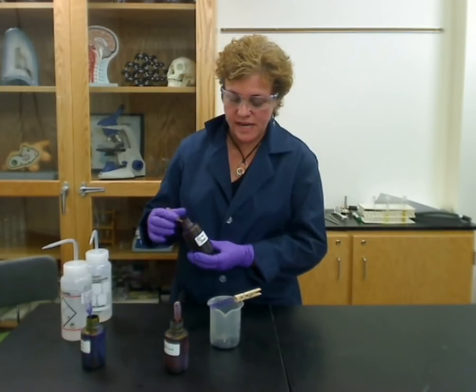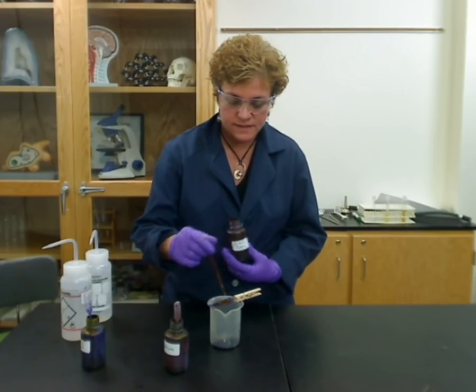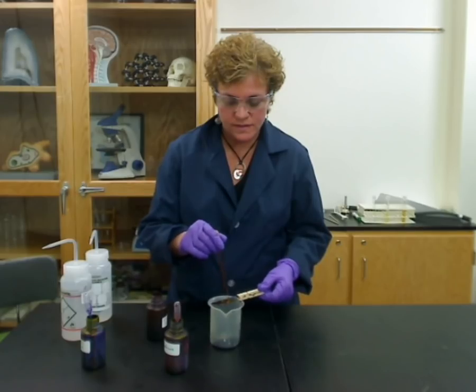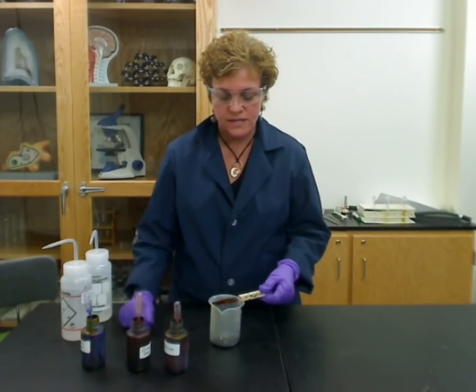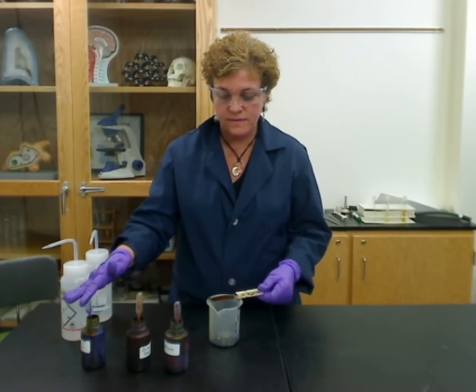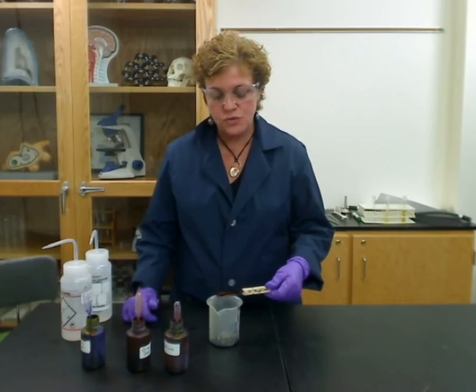The next thing you're going to add is something called gram's iodine, and you are going to flood the slide again over the part that has the bacterial smear, and you're going to sit and wait for a minute on that. After a minute has elapsed — so far it's been one minute for the crystal violet and one minute for the gram's iodine — this is the tricky part.